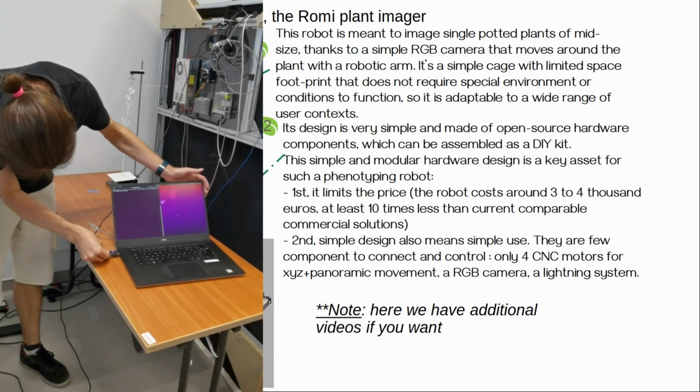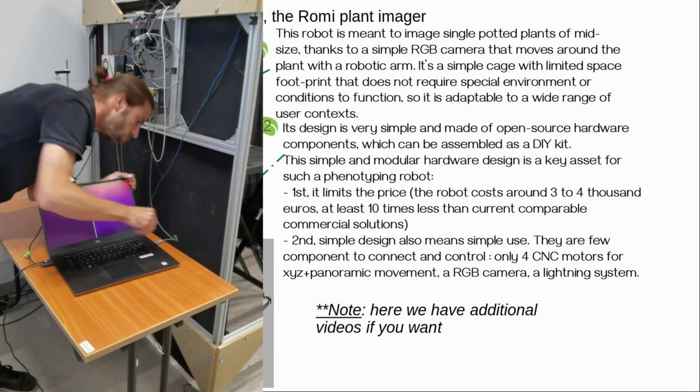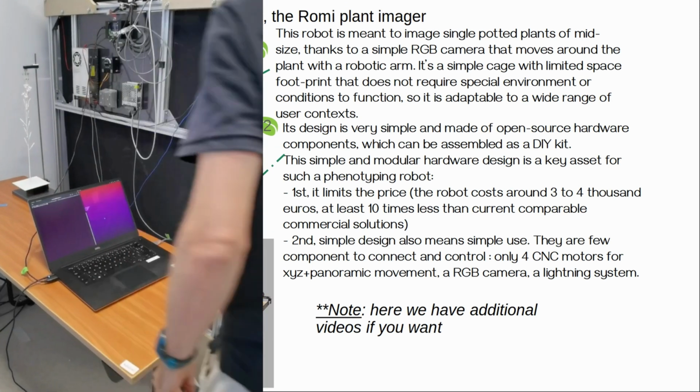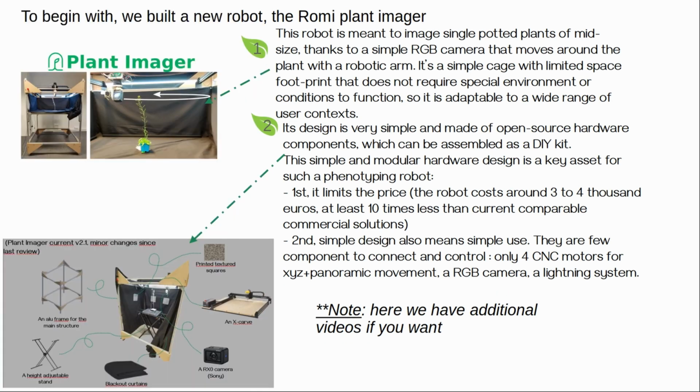Second, simple design also means simple use. There are few components to connect and control. Only 4 CNC motors for the XYZ panoramic movements, a RGB camera, and a lighting system.